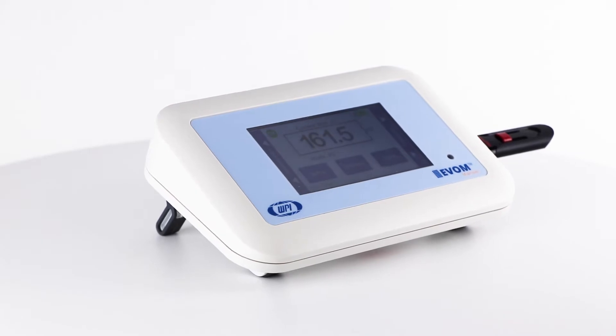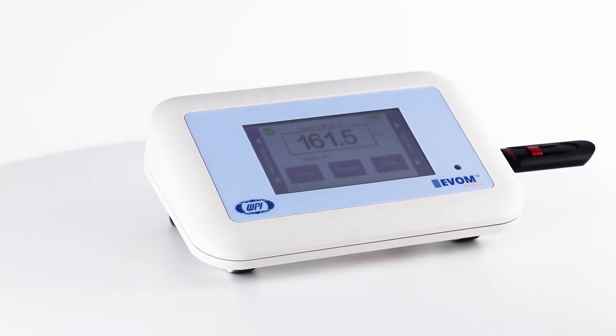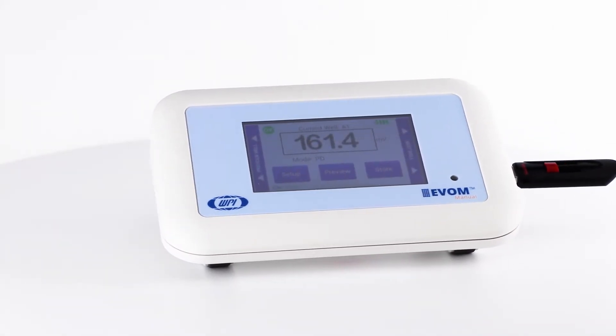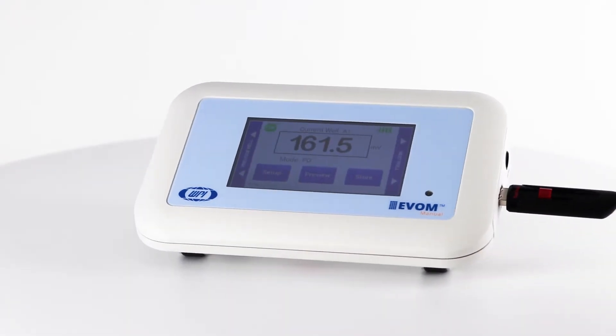EVOM Manual is WPI's newest instrument to measure transepithelial electrical resistance. Let's look at how to set it up and take resistance measurements.